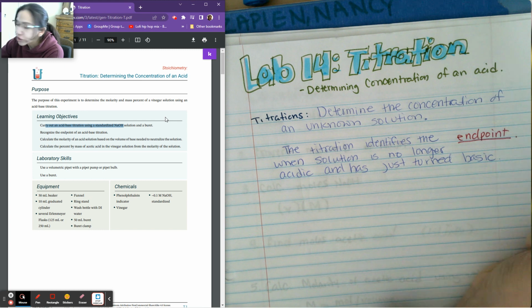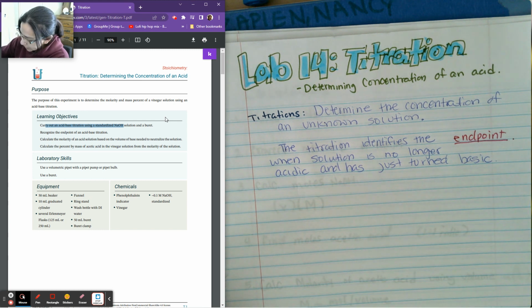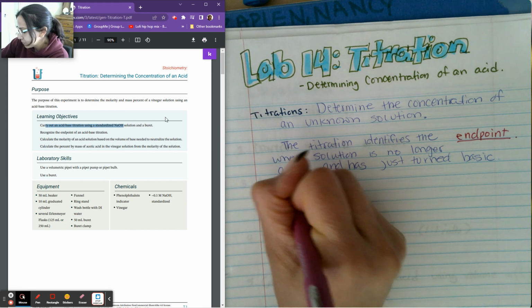And when I mean it just turned basic, I mean by one drop. Now, what comes before the endpoint is the equivalency point.